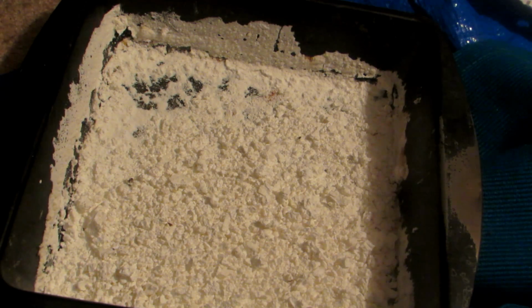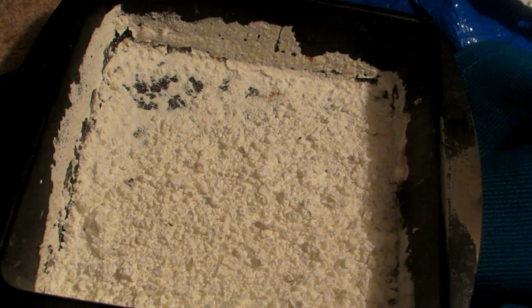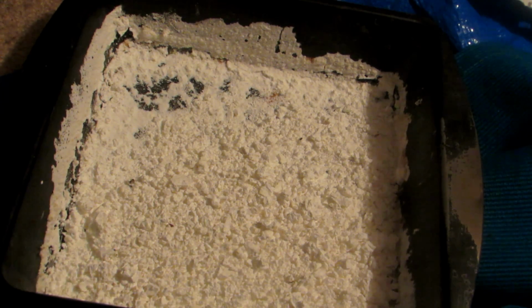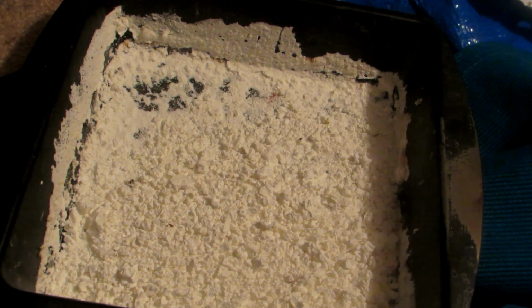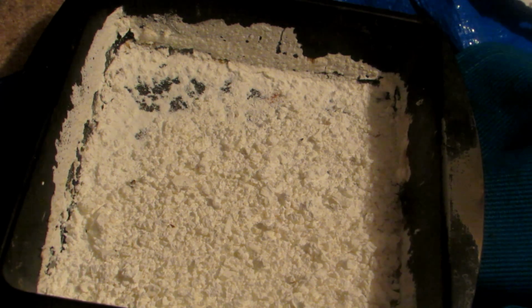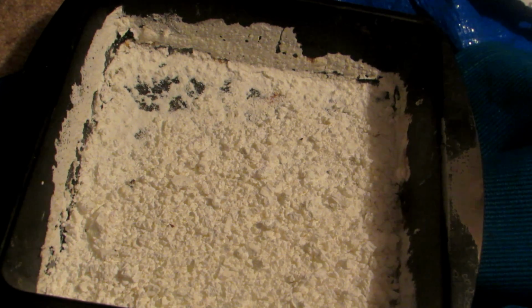However, it's still highly contaminated with various salts, such as sodium chloride, and probably still some sodium bicarbonate, which we used to neutralize the hydrochloric acid. I'm not 100% sure that this is actually silicon dioxide yet, because we may still have neutralized the silicic acid with that sodium bicarbonate, but it's really easy to test, and we will be doing this in a moment to purify it.